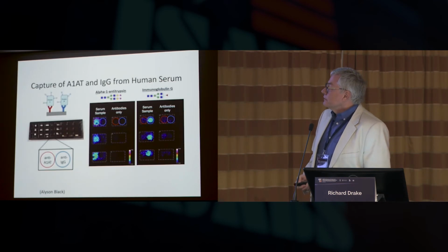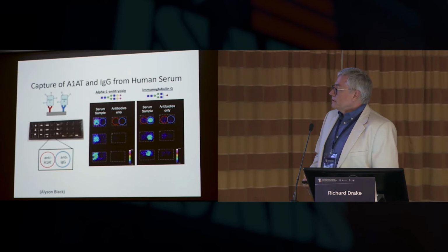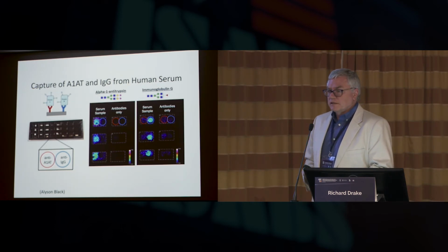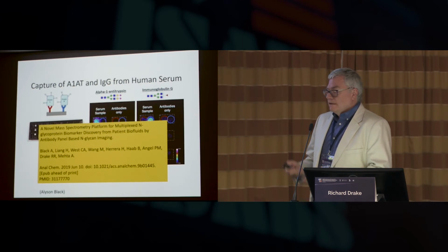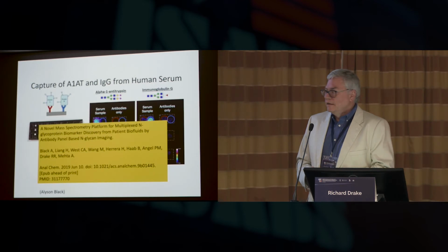And so this was just a quick example. We beat this to death, I should say. My student Allison Black did an extensive amount of work to prove the specificity of this, which I'm only summarizing in one slide. But it was just published, so you can check it out to see how we navigated this. Realistically, if we can do 2, we can do 4. If we can do 4, we can do 8. I think we're up to 8 right now, as far as that's the easy button.